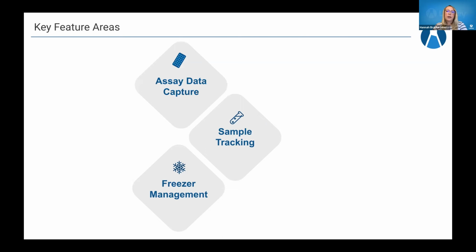The third component is really capturing experimental assay data. As you are tracking samples within the system, we also have this ability to track the experiments and the results around those samples that have been collected. Our task-based workflow management tool is a way to track those sample processing requests or work that you're really doing within the laboratory itself.